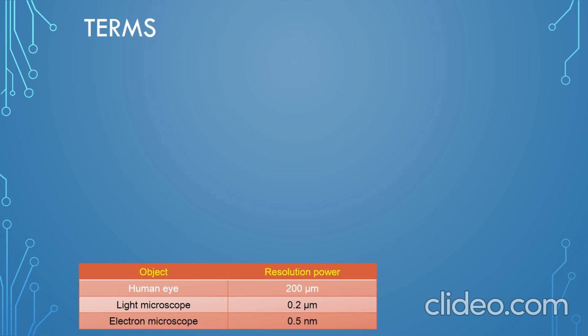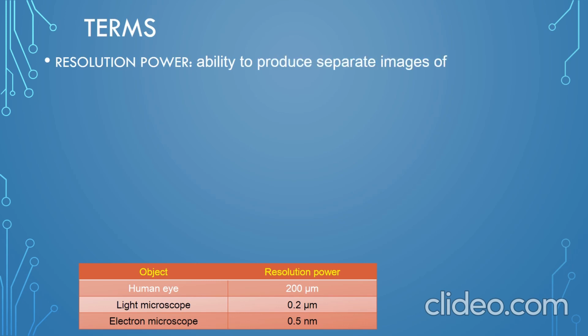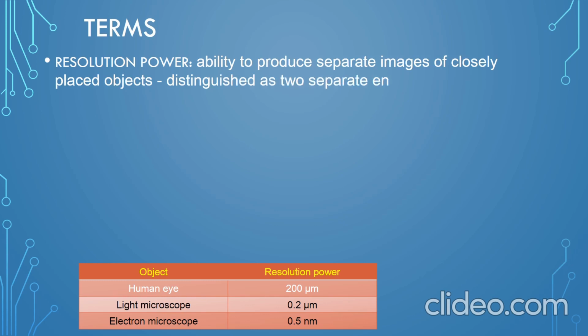Next, what is the refractive index? Refractive index can otherwise be called the index of refraction, and it is a value calculated from the ratio of the speed of light in a vacuum to that in a second medium of greater density. It can be used in a calculation like n, the refractive index, is equal to c by v. c is the speed of light, and v is the phase velocity of light.